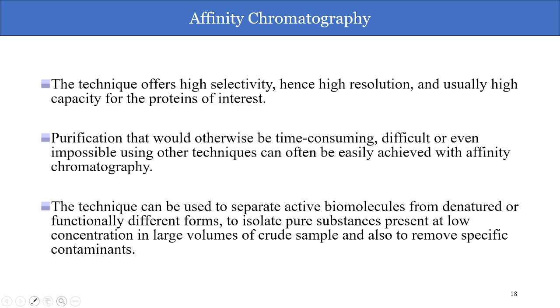because not all molecules have an affinity for a particular substance. But if your protein of interest does, it's recommended to use such an affinity chromatography. There are so many affinity types that we know about, which we can actually use in our system, or which we can incorporate in our protein of interest to have an affinity towards that particular substance, and hence we will be able to purify it.